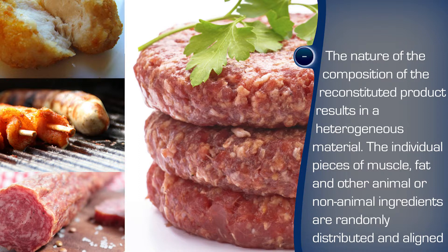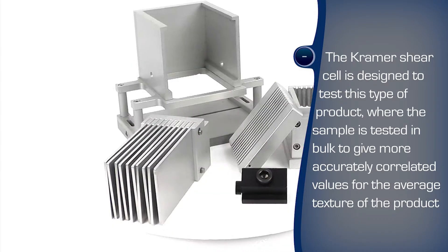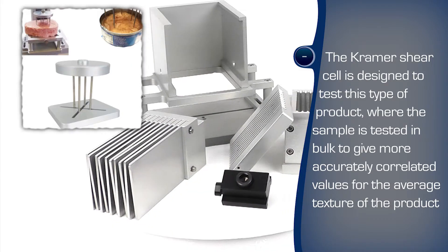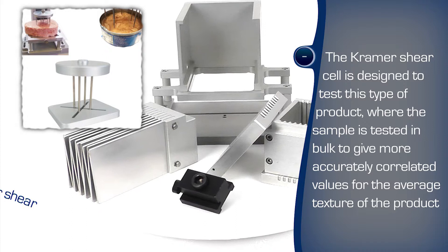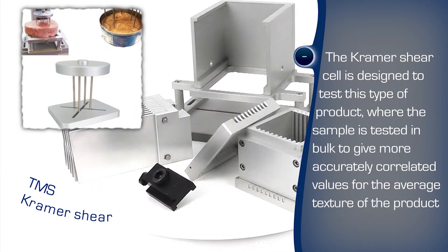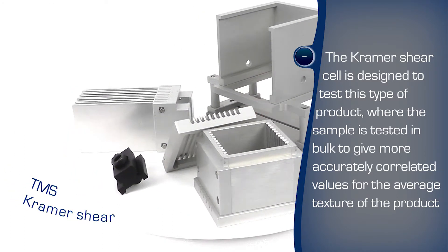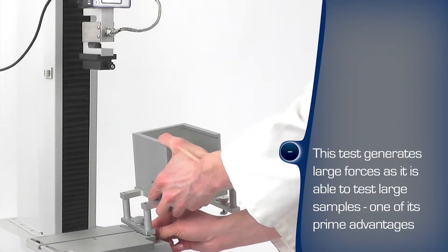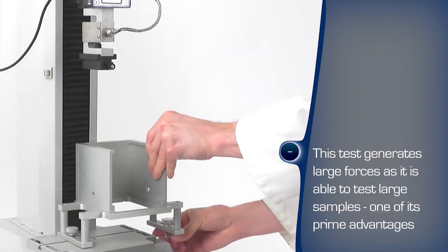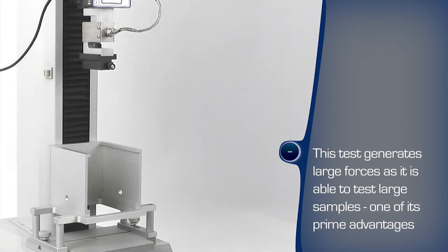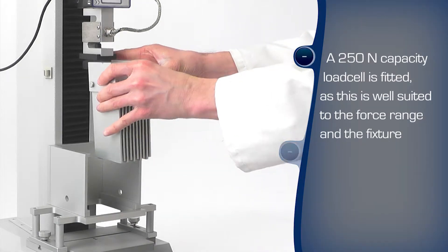A bulk analysis method is most suitable for a product of this nature — a heterogeneous mixture with the objective of being experienced as a homogeneous entity. Various test fixtures are available to investigate the average texture in a bulk sample. The TMS texture analyser is fitted with an FTC Kramer shear compression cell to compress, cut and slice through the burger as would the consumer.